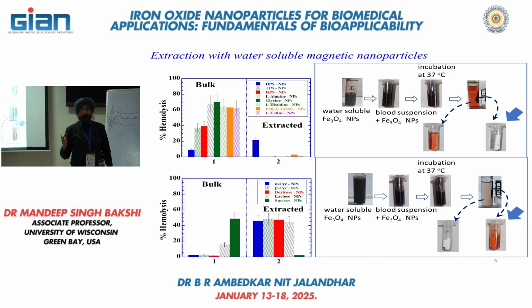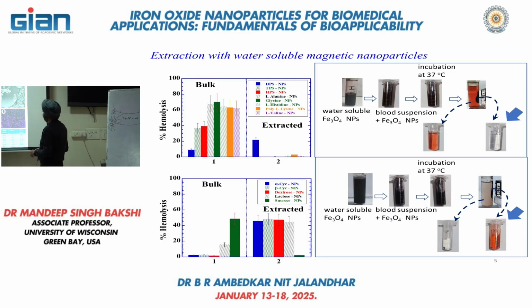molecules which were providing the colloidal stability to the iron oxide nanoparticles. And what we observed is that they are working excellently and they are extracting the blood cell without inducing the hemolysis. These are the experimental observations. So I'm taking you to the next slide.